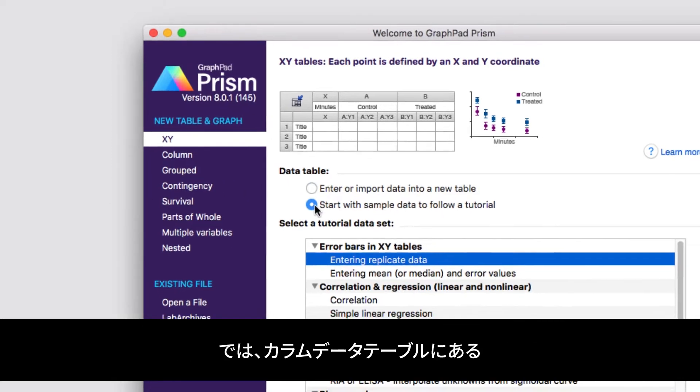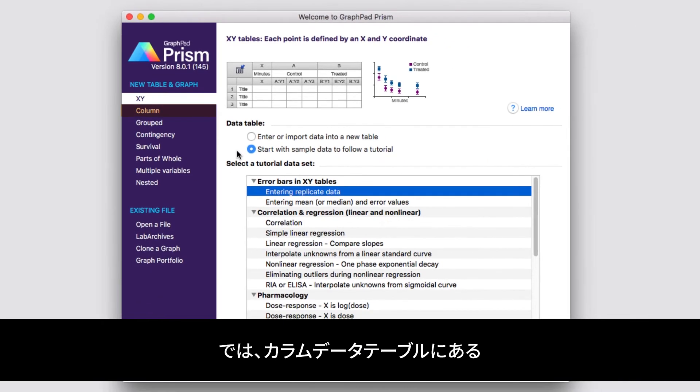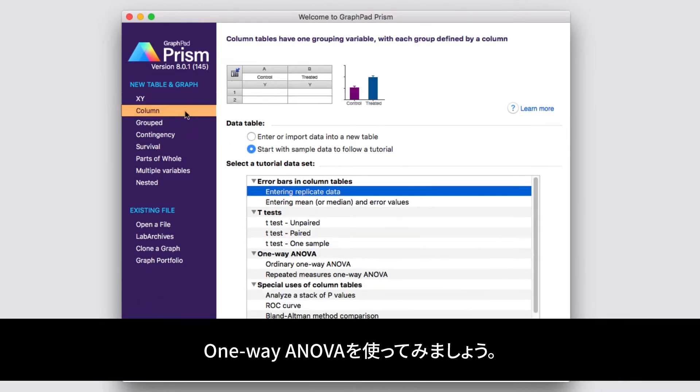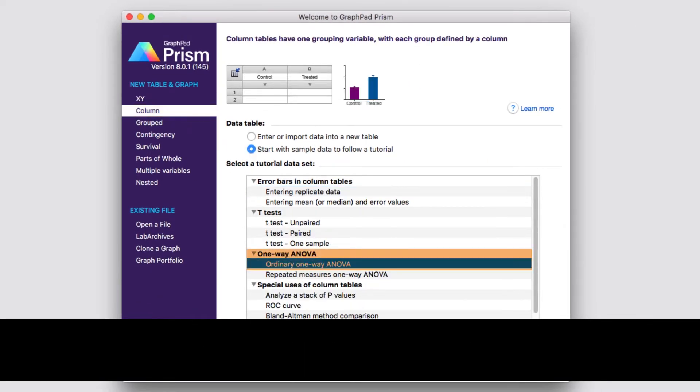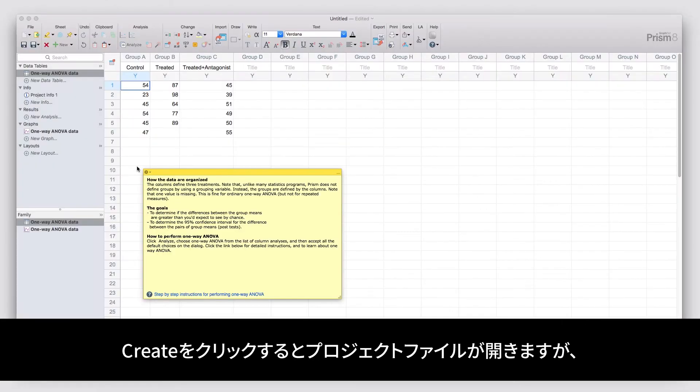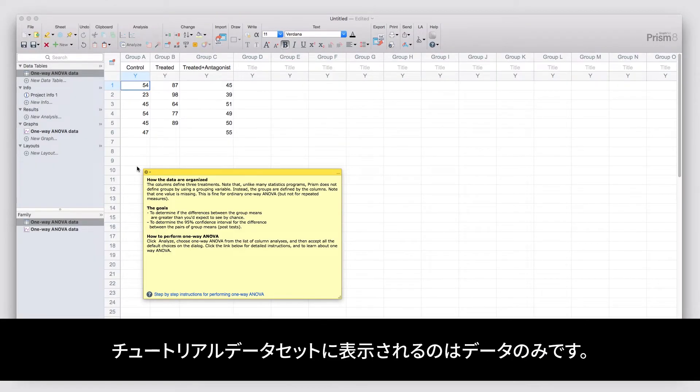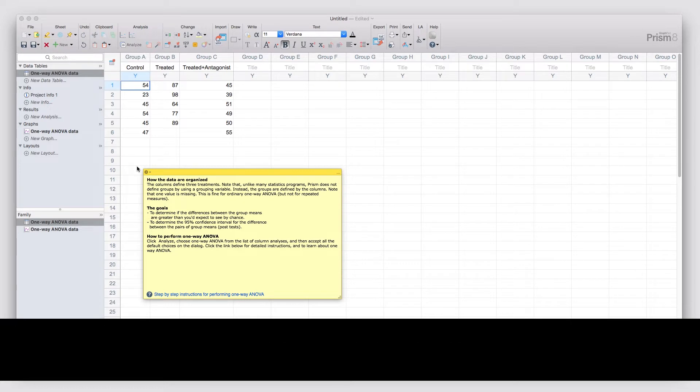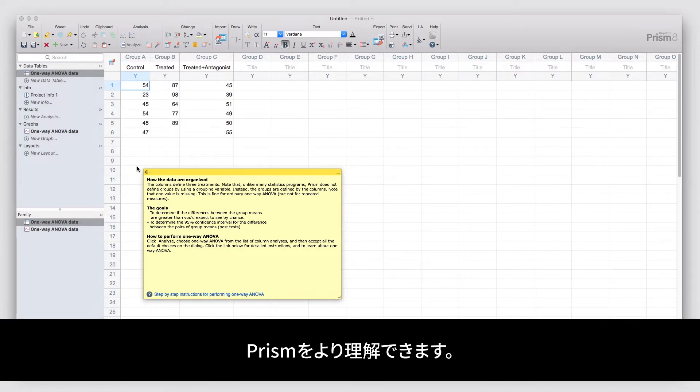We're going to start by using the tutorial data set for an ordinary one-way ANOVA under the Column Data Table. Clicking Create brings up the project file and shows you the tutorial data. However, like other tutorial data sets, this only shows you the data. You'll still need to perform the analysis yourself so you can learn how to better navigate Prism.